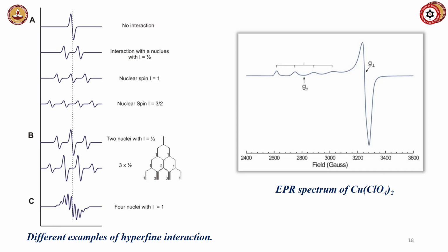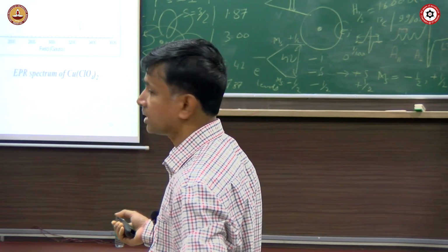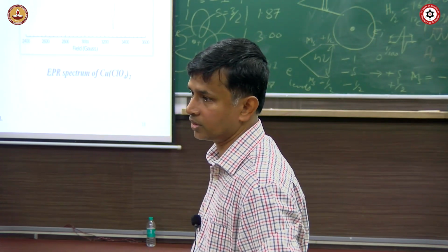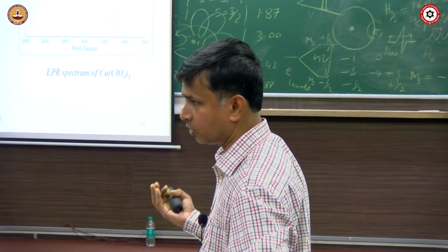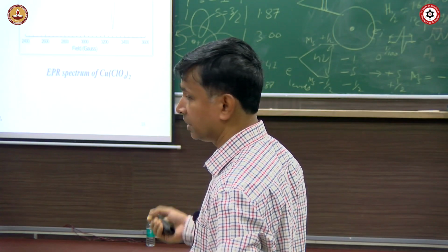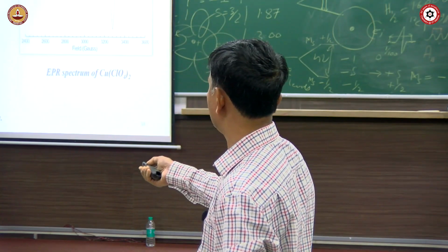If I keep one electron on oxygen or sulfur, it will be just one signal because it has 100% spin-free nucleus. But the moment I put the same electron on any other atom where you have spin activity, like phosphorus, with spin equal to half, or fluorine, also half, so F dot or P atom, they will produce two signals. These signals will be doublets, because 2nI+1 equals 2 if I equals half, and it will come like this.